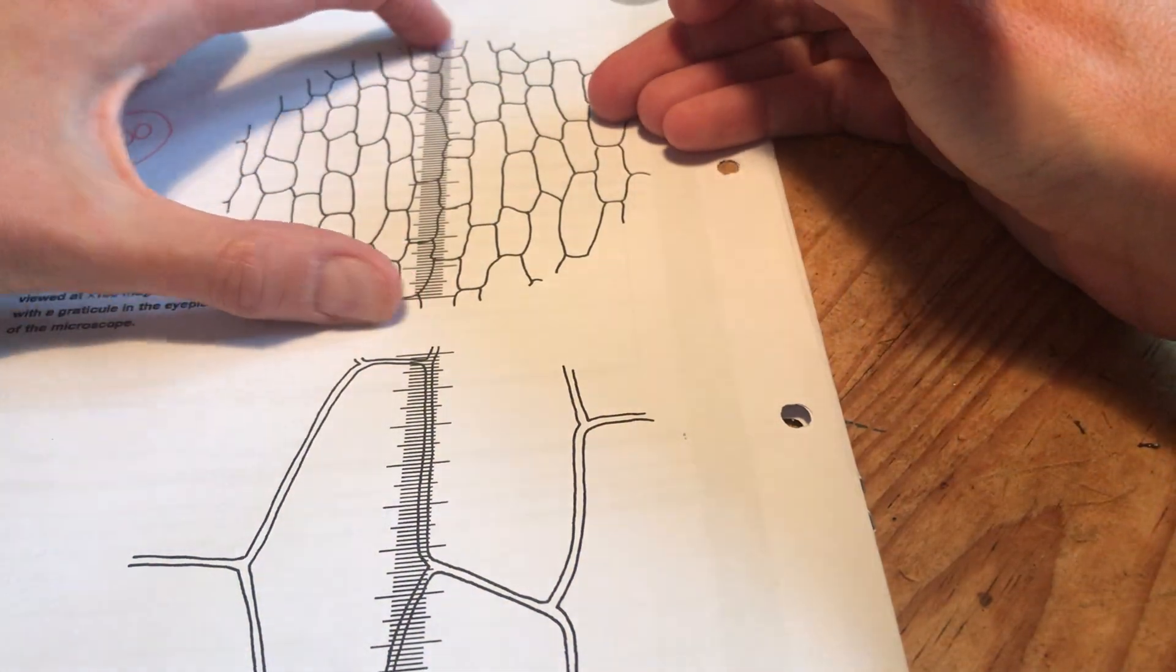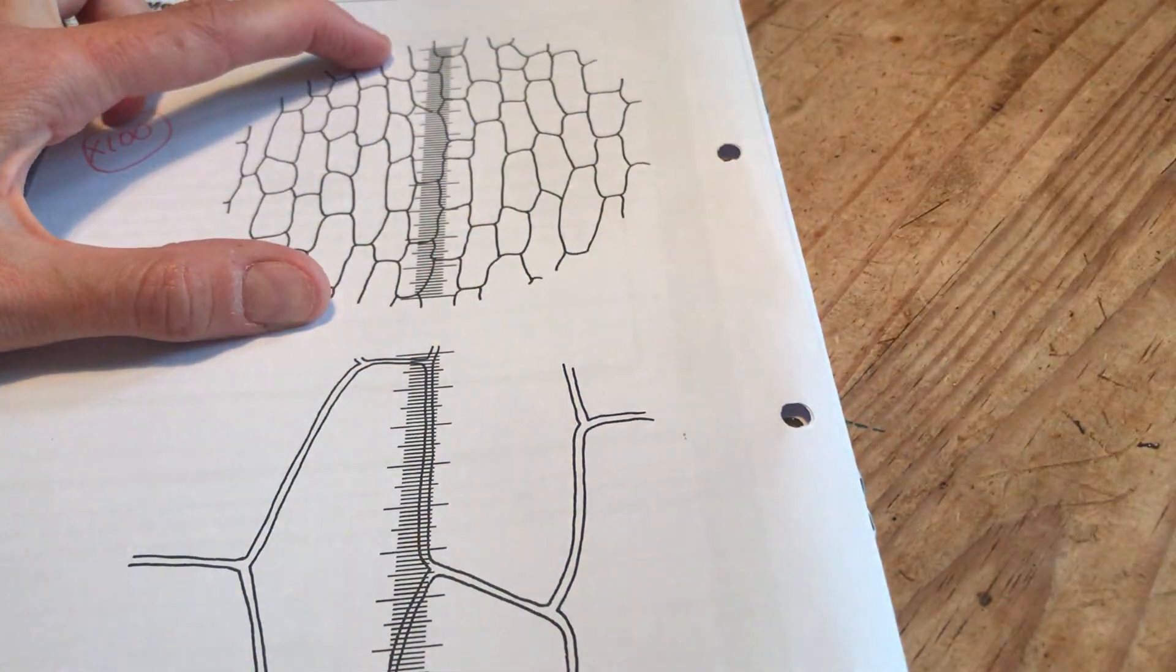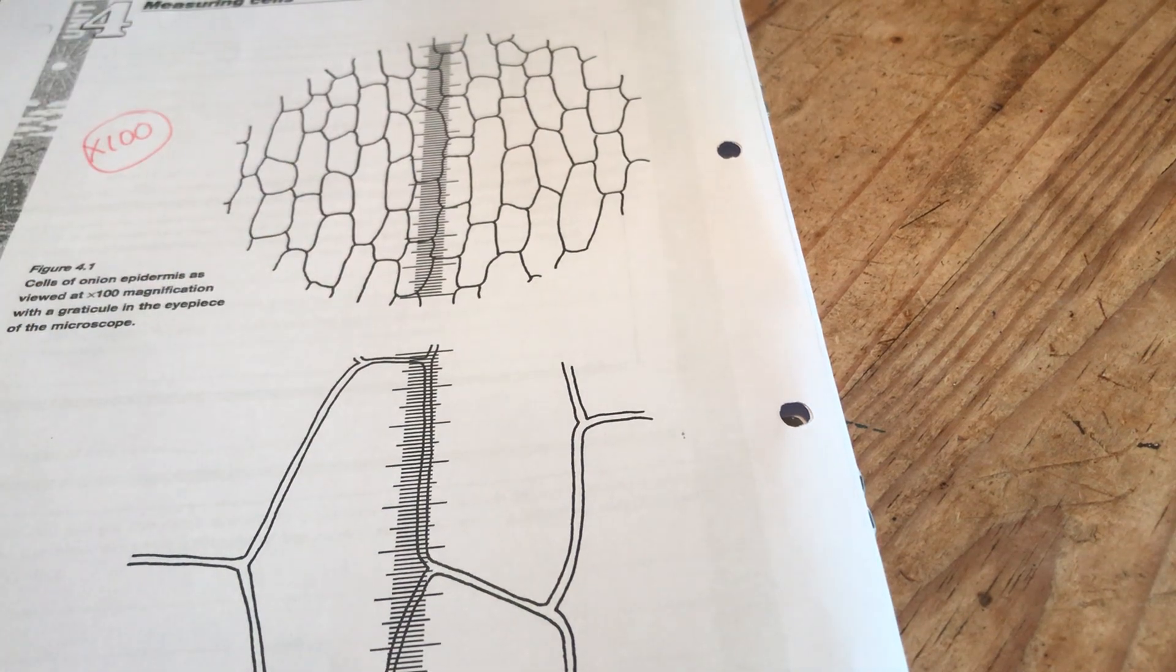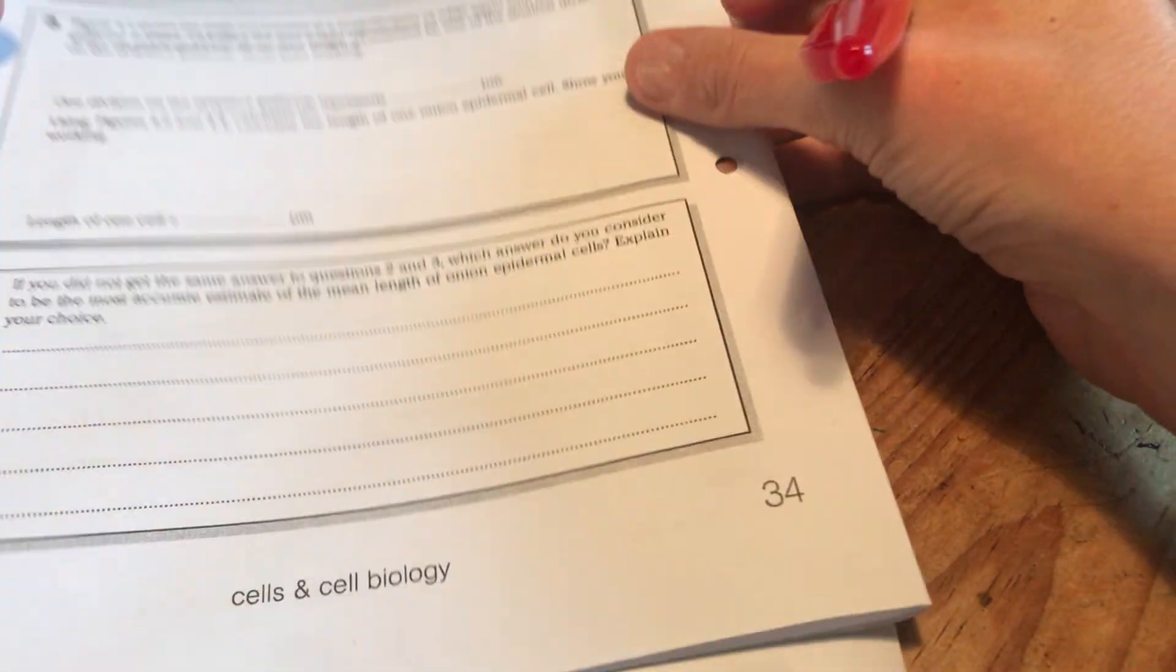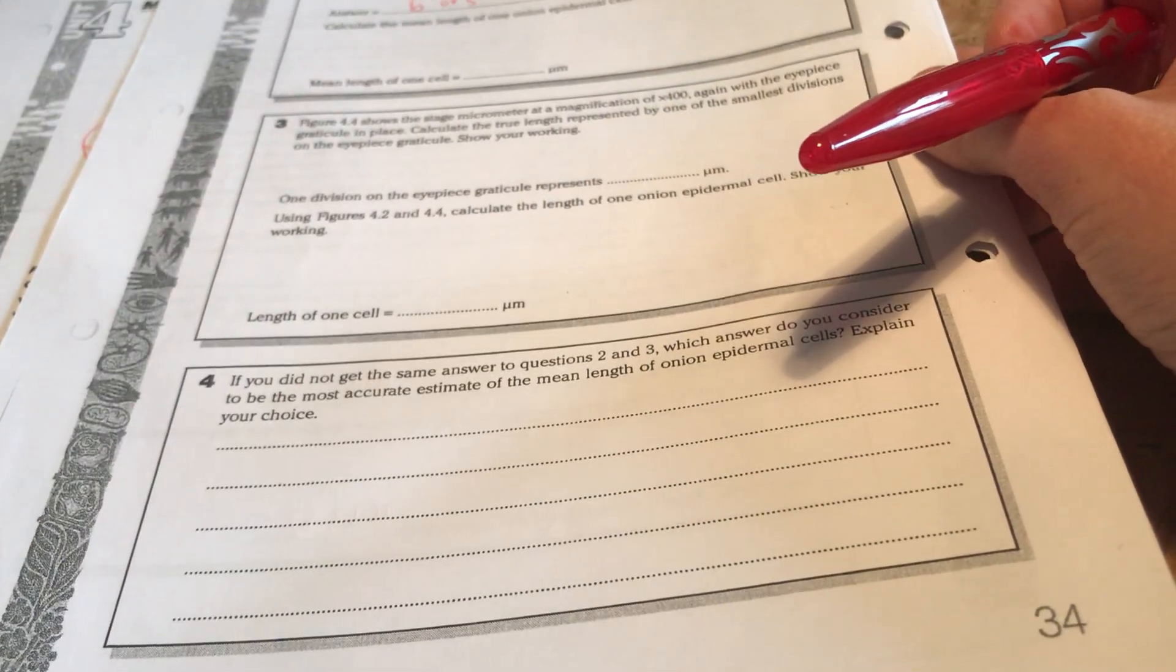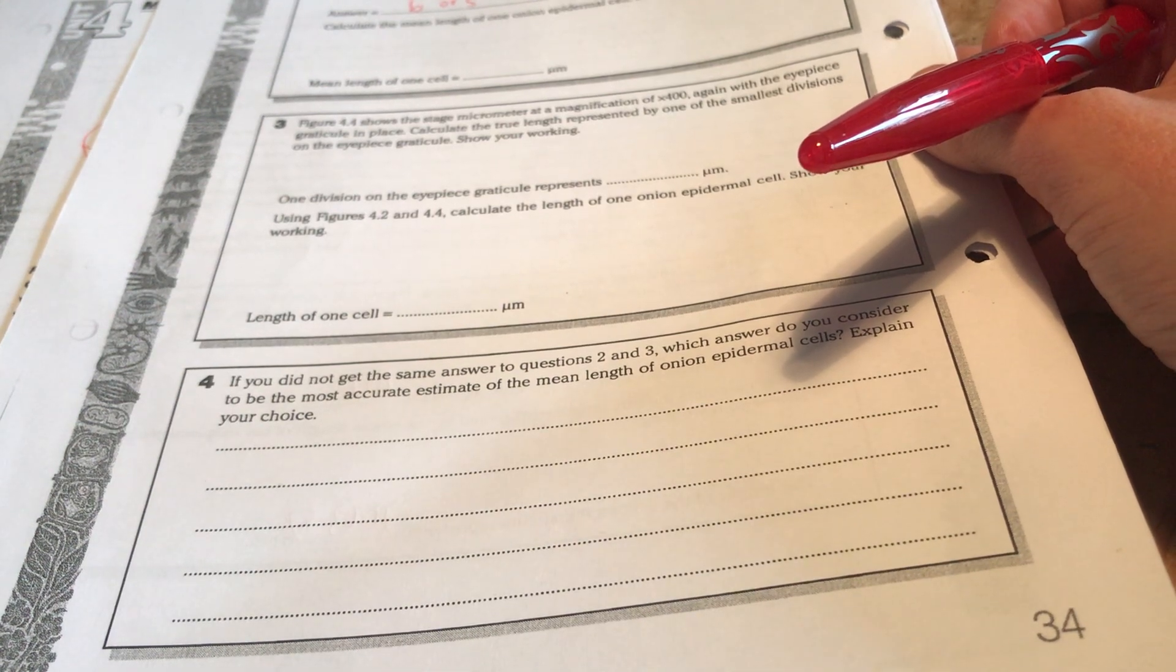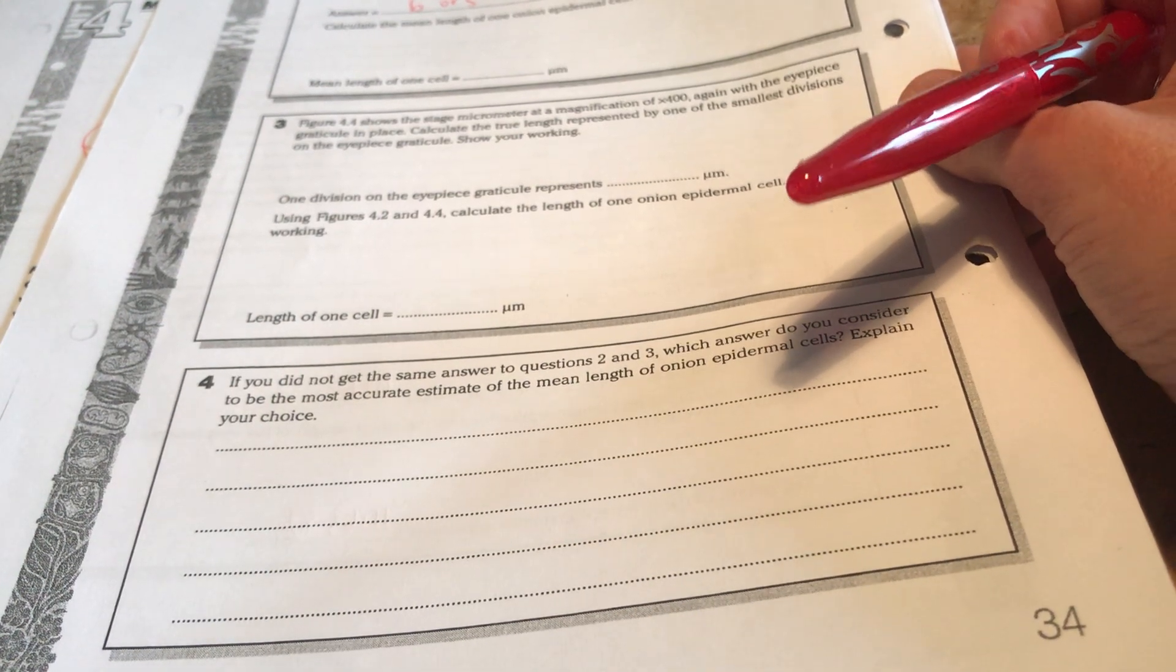Or if I was to move that mentally over somewhere else I might get a different number. It's because all the cells are very different lengths aren't they? So we're looking for an answer of somewhere in the region of five or six here for this answer. Now it says calculate the mean length of one onion epidermal cell. Show your working. You've got a few ways of approaching this.